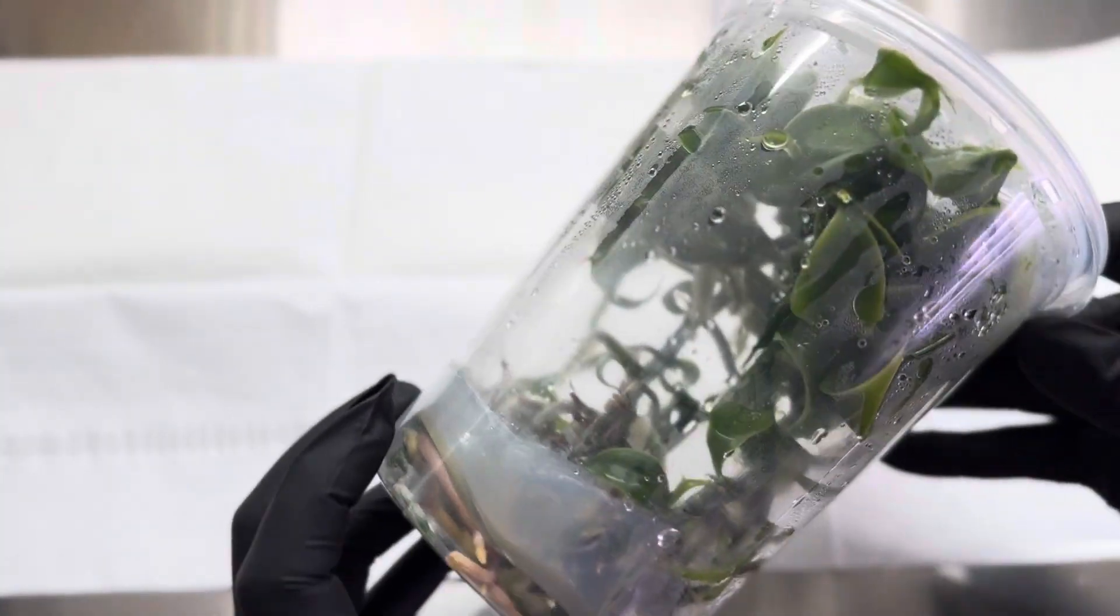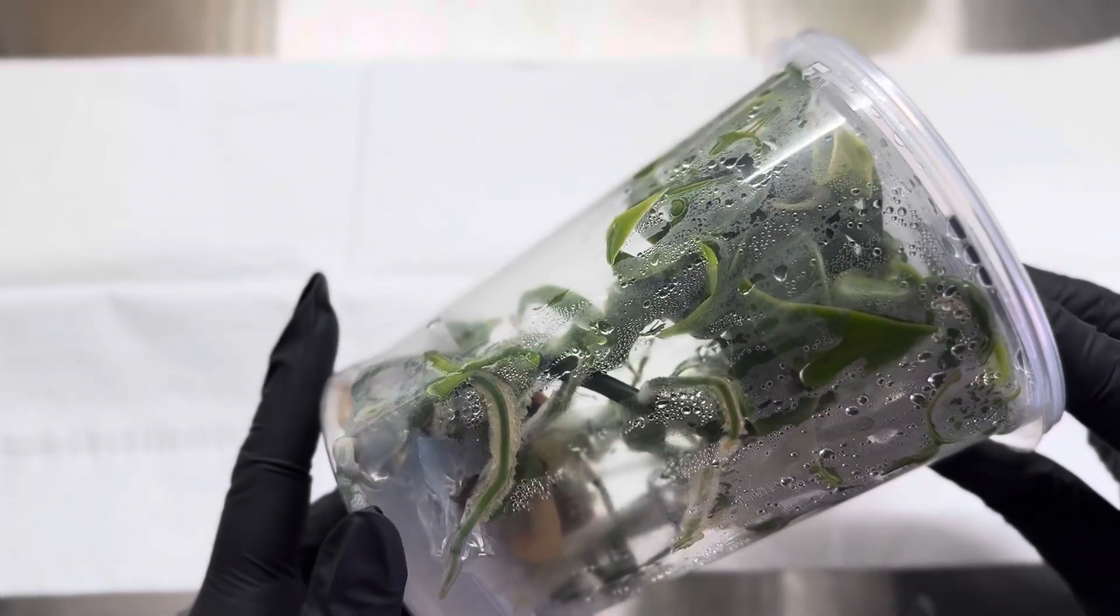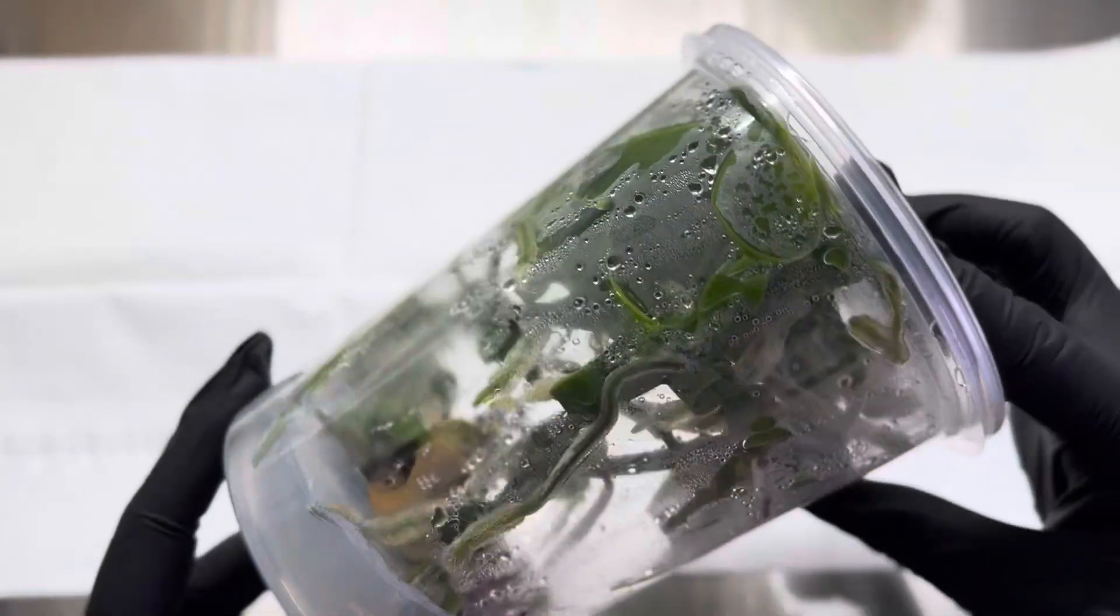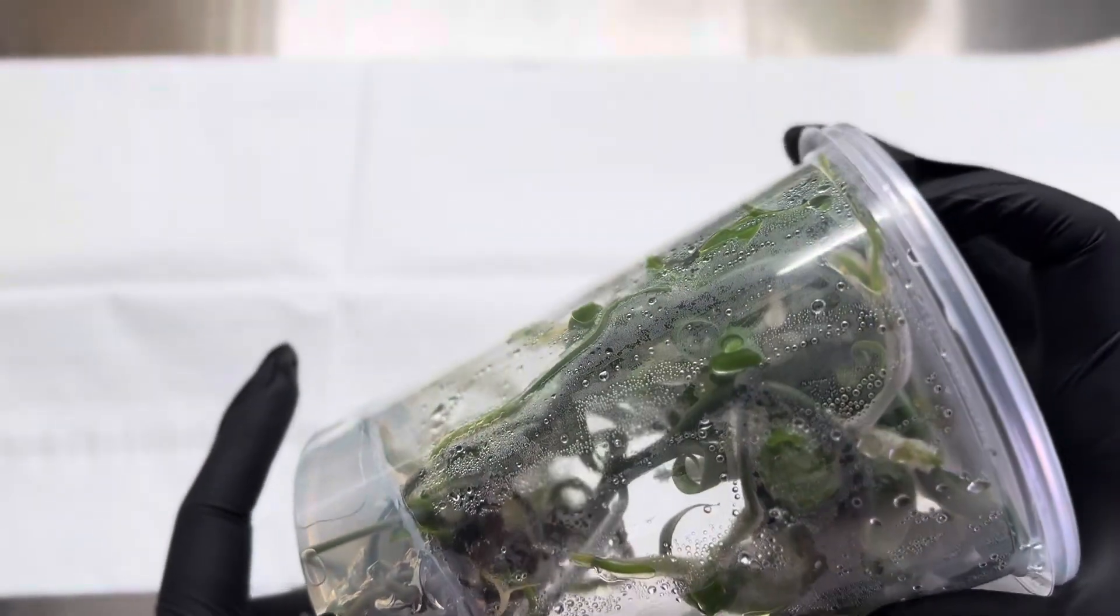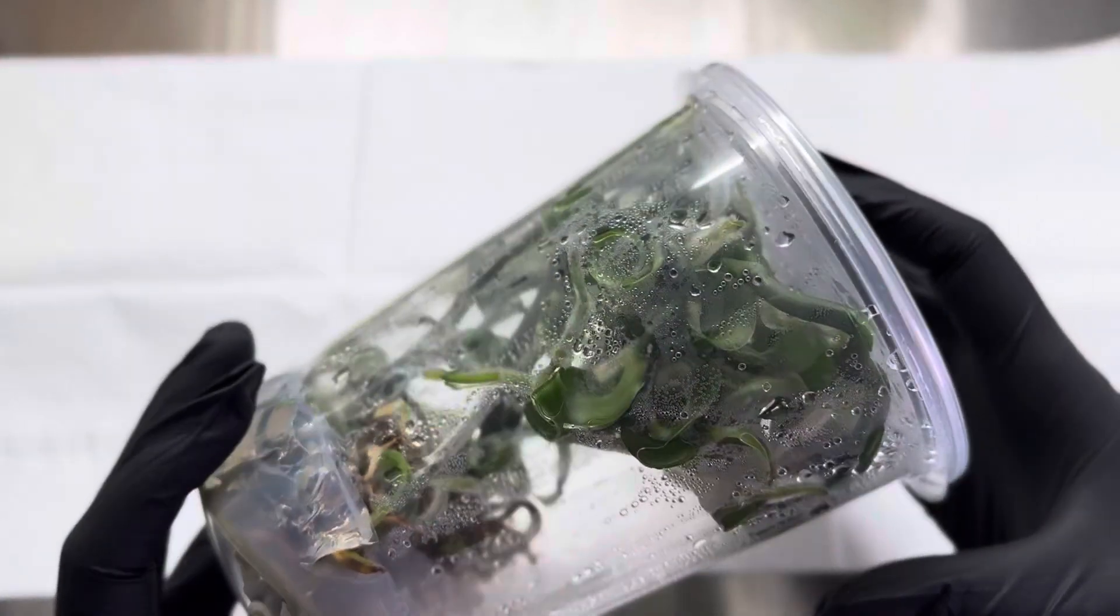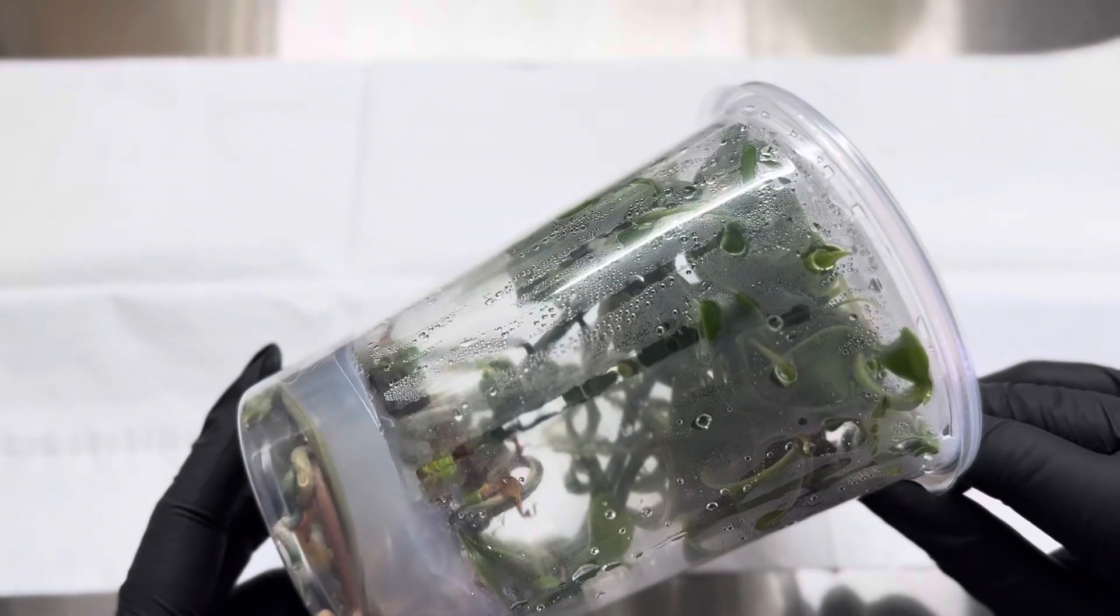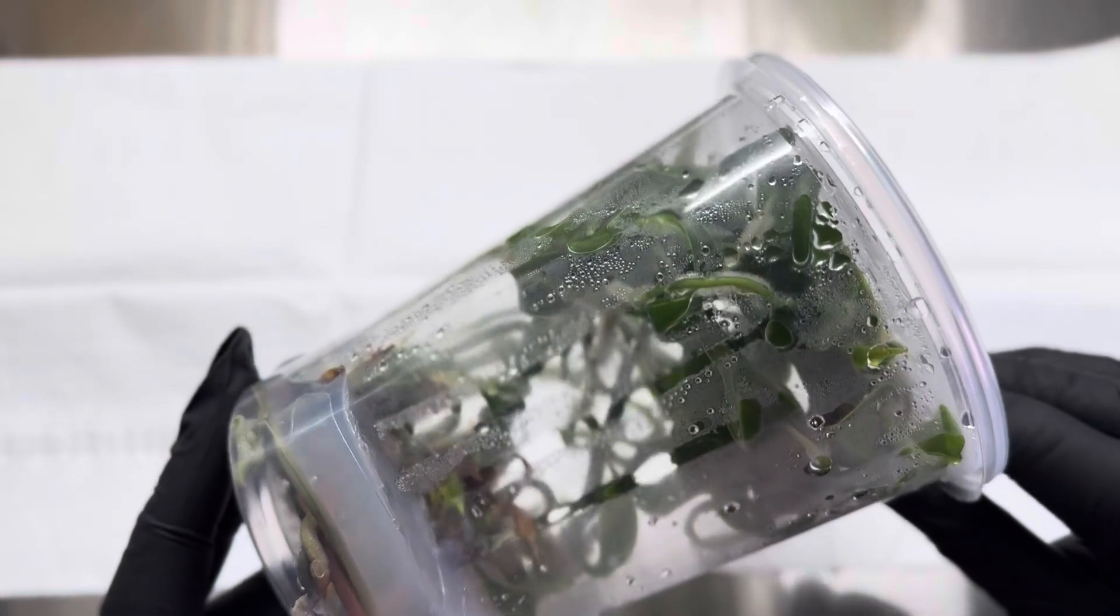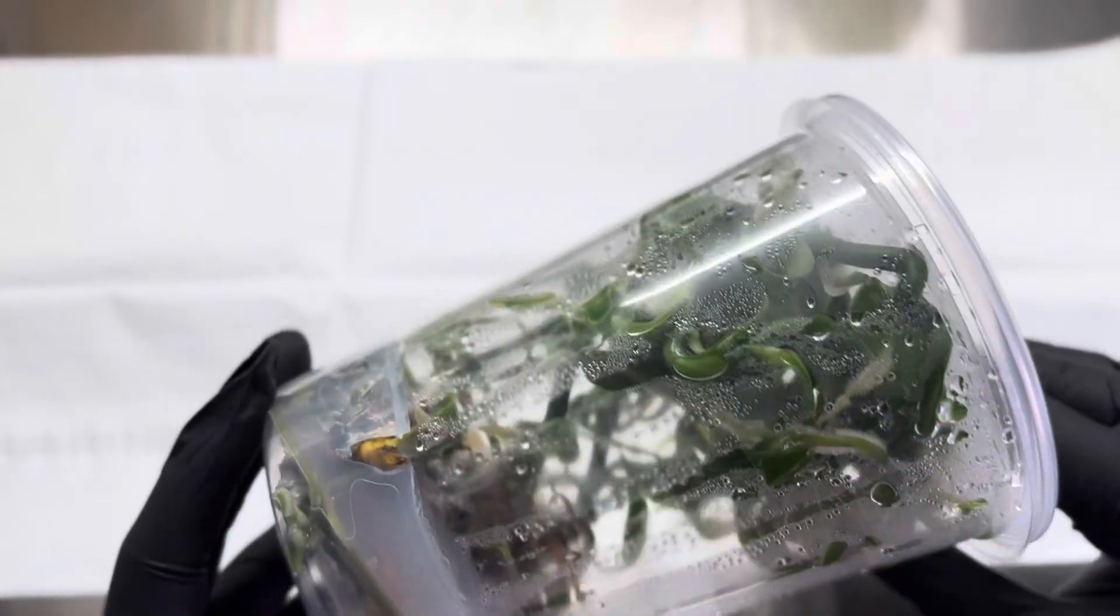Alright, just wanted to show off this beautiful vanilla plant that I started from tissue culture a couple months ago that's gone absolutely crazy. We're going to go ahead and uncontainer this so we can really look at the whole thing.